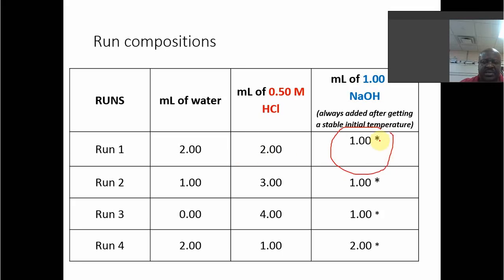There's an asterisk there. The reason is we choose this is 1 mil, so we can deliver it in one shot with the auto pipette. As you know, our auto pipettes don't deliver more than 1 milliliter. There's an error here, and that is, if you look at this one, this asterisk should be here. The reason is, in this case, of course, this is a one-shot system. You'd have to do 2 shots in order to get that in there.